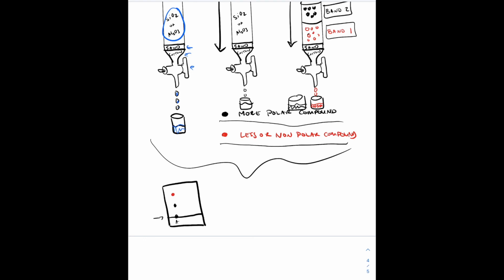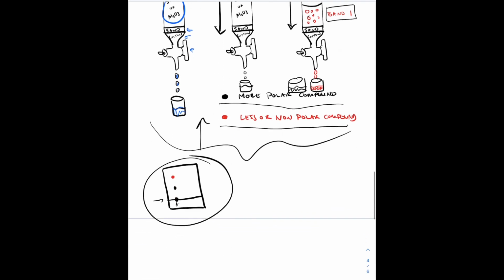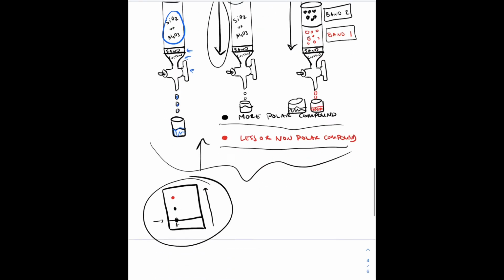So imagine this represented what was just explained above in the column chromatography. This is what it would actually look like on a TLC plate. So if I spotted that organic sample here, rather than placing it at the top here, and then I ran the solvent, this is the difference. Again, as I stated in the beginning of the video, the eluent travels up the TLC plate, whereas in a column we're traveling down the column.